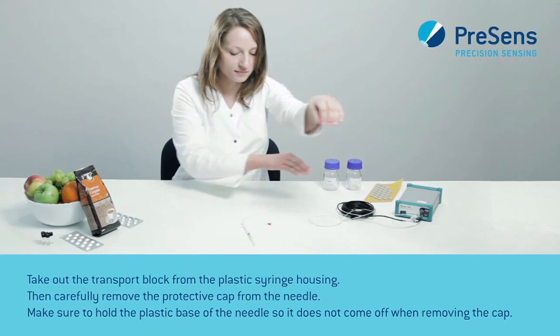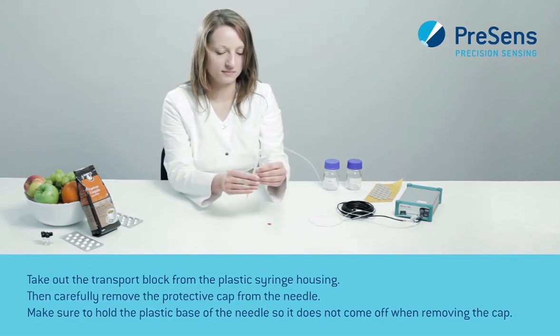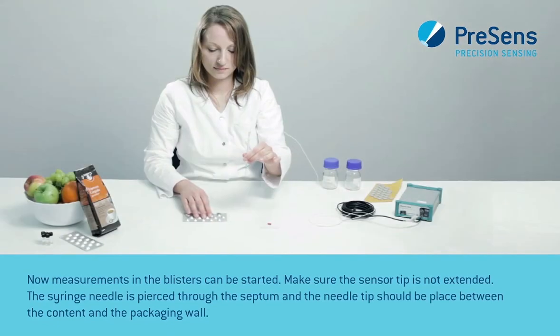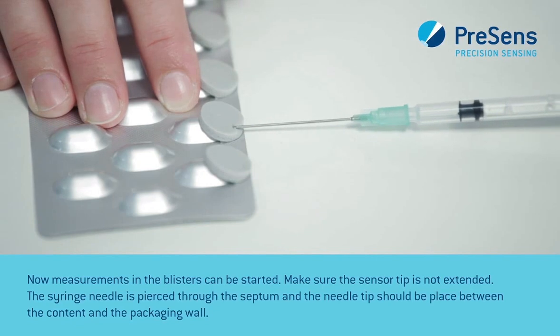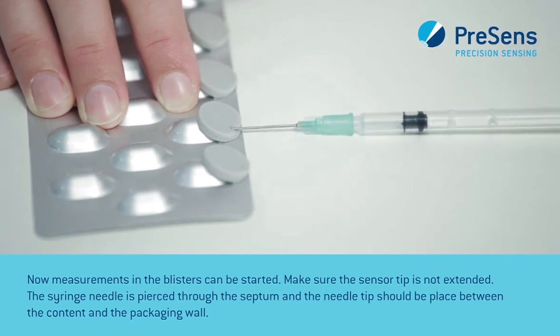Take out the transport block from the plastic syringe housing, then carefully remove the protective cap from the needle. Make sure to hold the plastic base of the needle so it does not come off when removing the cap. Now measurements in the blisters can be started. Make sure the sensor tip is not extended. The syringe needle is pierced through the septum and the needle tip should be placed between the content and the packaging wall.